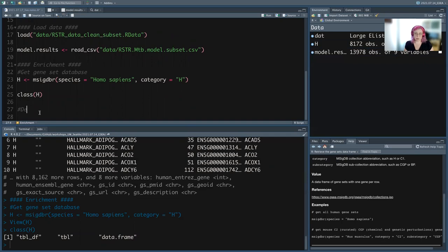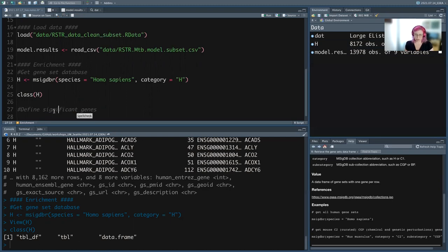That's our database loaded in. Now we need to define what we mean by significant genes. In this case, we're comparing TB stimulated versus media. FDR cutoffs to define significant genes are arbitrary and depend on every dataset. As an aside, something I wanted to show is just looking at the distribution of your FDR values. Sometimes it's really clear where a cutoff should be, and sometimes it's not.